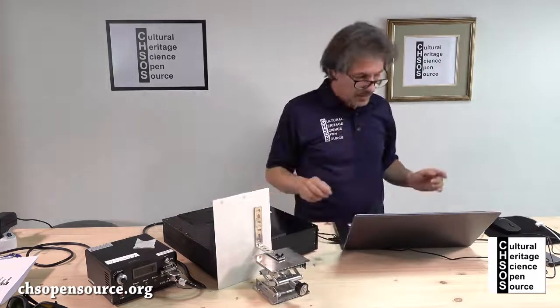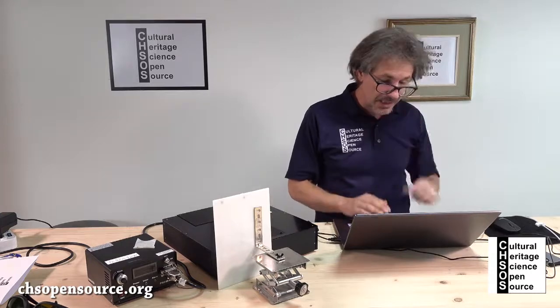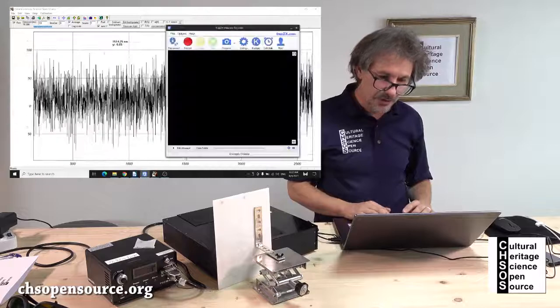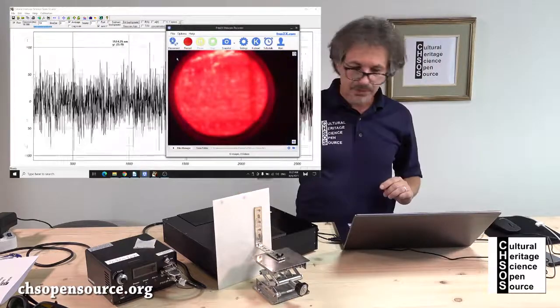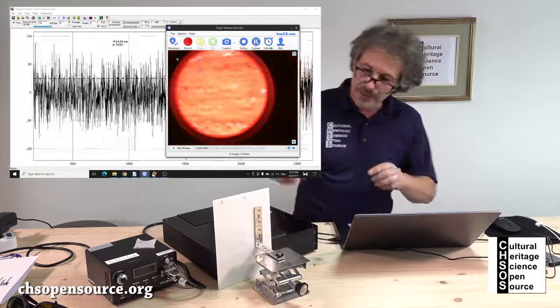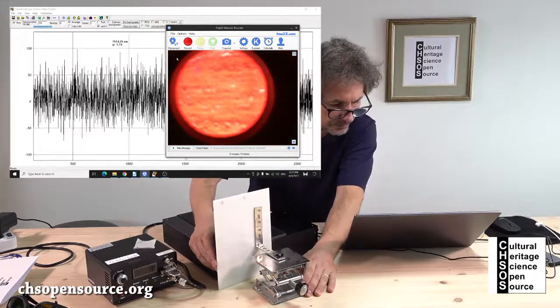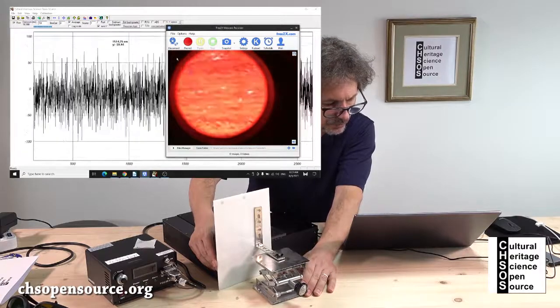Okay. Over here we're going to use the camera just to check that we are facing the right pigment. Okay, there we are. Okay, so now we are on the camera. There is plenty of light. I can turn on my lights over here. Try to do a preliminary focusing. Okay, out of focus, on focus.